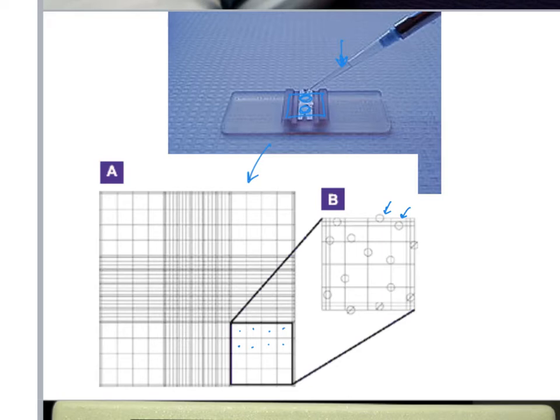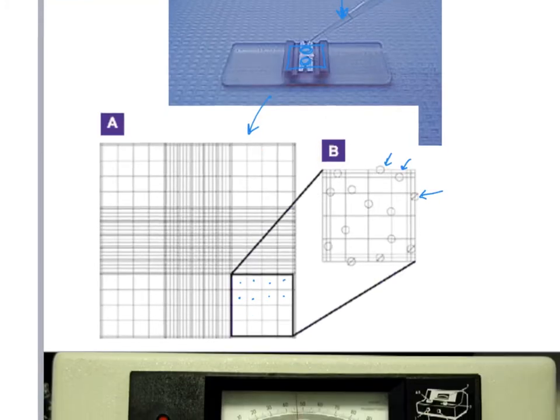Some drawbacks with this is that these are probably some kind of yeast cell or blood cell because they're pretty large. Bacterial cells are a lot smaller, a little bit harder to count, and definitely harder to tell just by looking at them if they're dead or alive. And oftentimes it's the ones that are alive that we're really interested in. Okay, and you also have to have, again, the right dilution. If you've got too many here, you can't count them accurately. If you've got too few, it's not statistically significant. Okay, but that's direct cell counts using a hemocytometer.